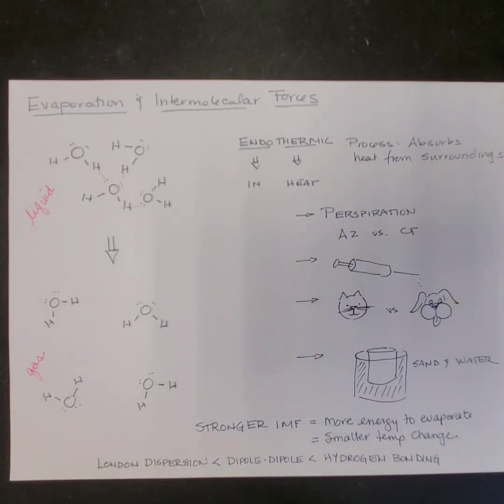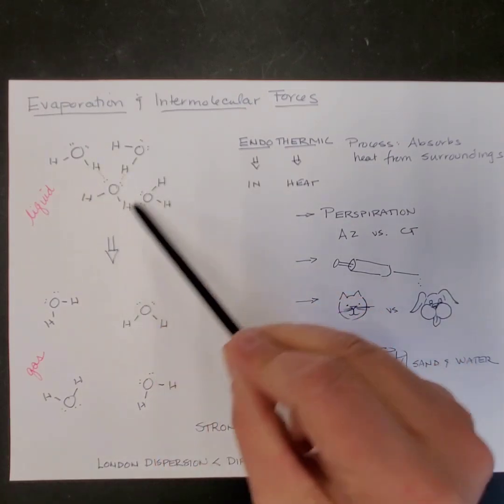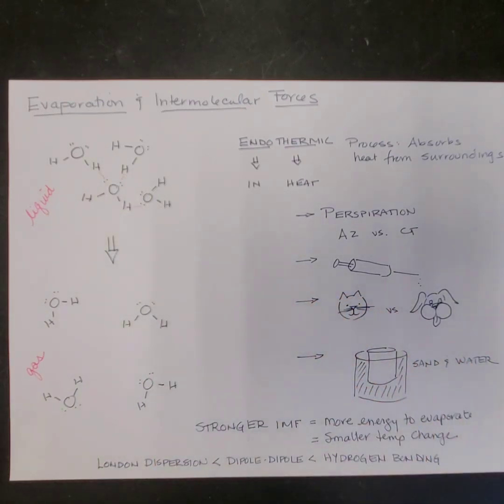Okay, today's lab we're going to be looking at the effect that intermolecular forces have on evaporation. So I need to talk quickly about what evaporation is and what it means to say that evaporation is a cooling process. Now what we have over here in this picture is water.